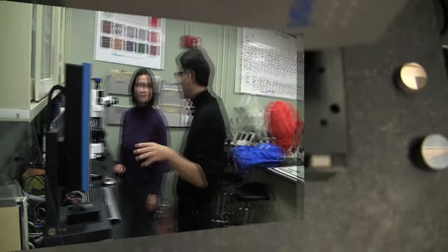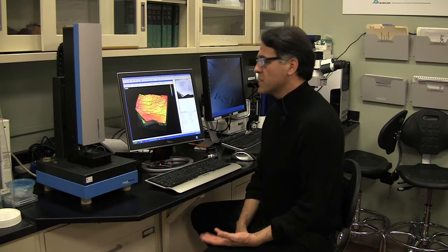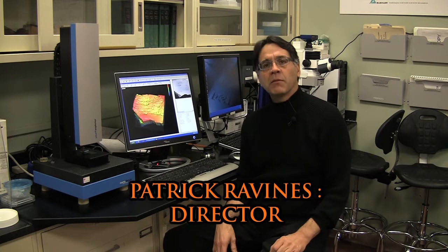What we have here is a confocal spinning disc microscope. In conservation science at Buffalo State, we're introducing this technology, this instrumentation, to be able to better evaluate surfaces and what's happening to them, either through conservation treatment or through deterioration.